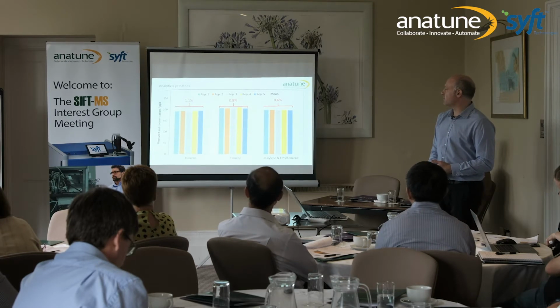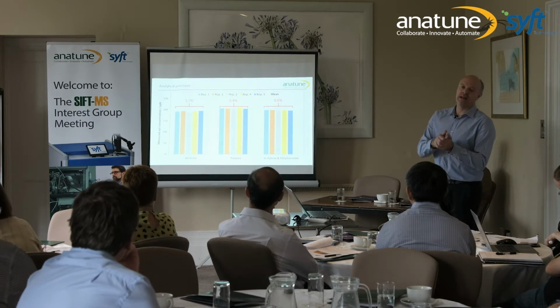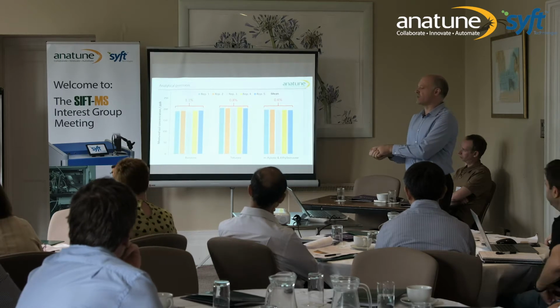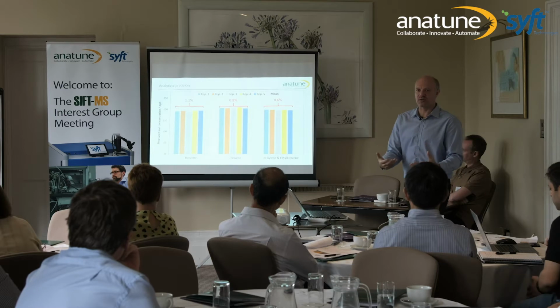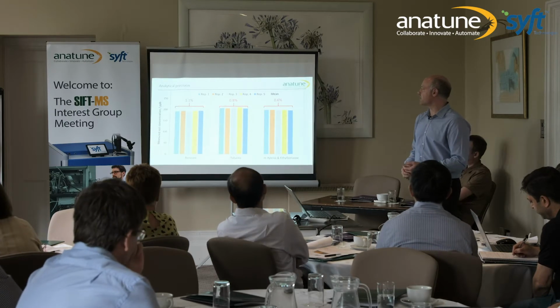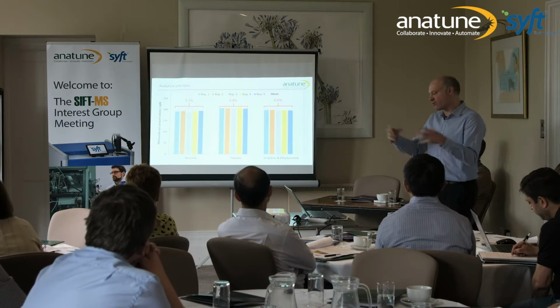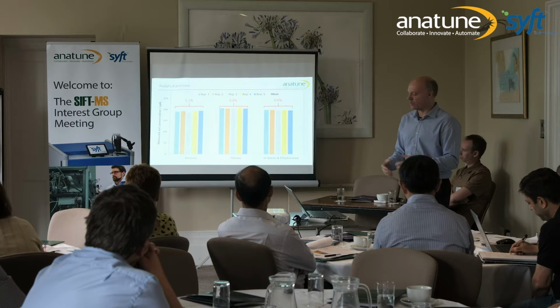So again, let's make up some samples. In analytical precision, as opposed to system precision, we're looking at our samples now, not our standards. We're spiking into a sample or getting a real sample and running multiple replicates and seeing if we get the same result across multiple replicates. So this is a 200 ppb spiked soil sample, run through the whole methodology, doing the calculations of the calibration curve to see what we get for the precision.